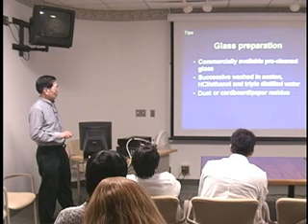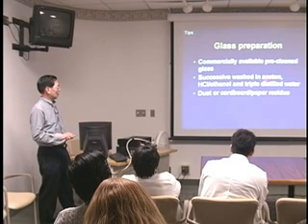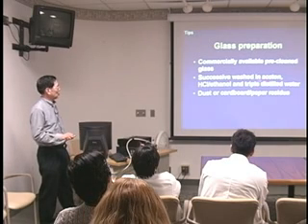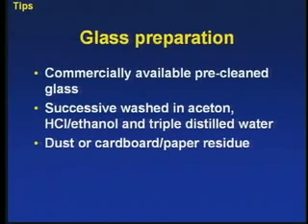If you don't trust even that kind of commercially available slide, you can do the cleaning yourself by repeated washes of the slide in the sequence acetone, HCl, ethanol, then finally triple distilled water to get a very clean slide. And even if the commercially available pre-cleaned slides are good, you still make sure there's no dust or cardboard or paper residue on the slide. That can completely destroy your result.